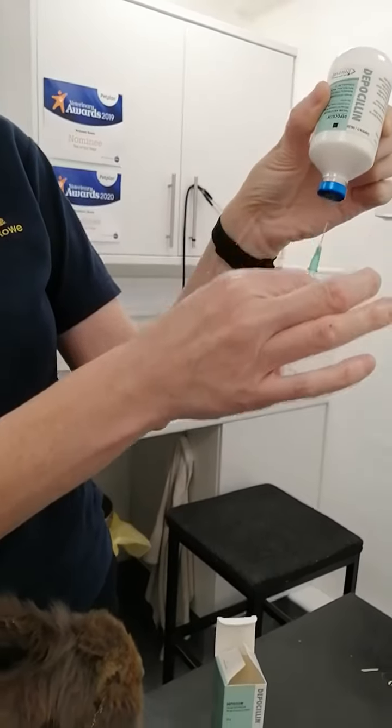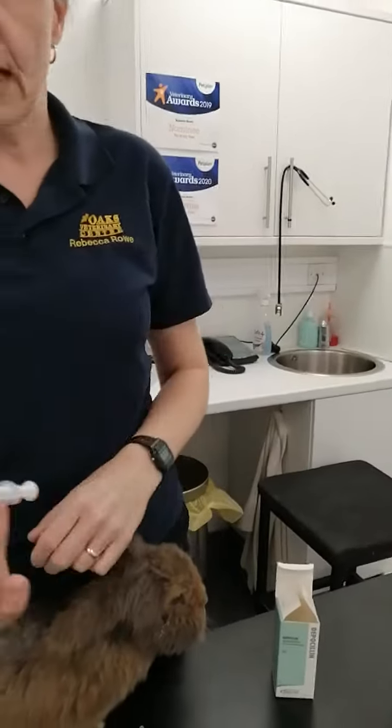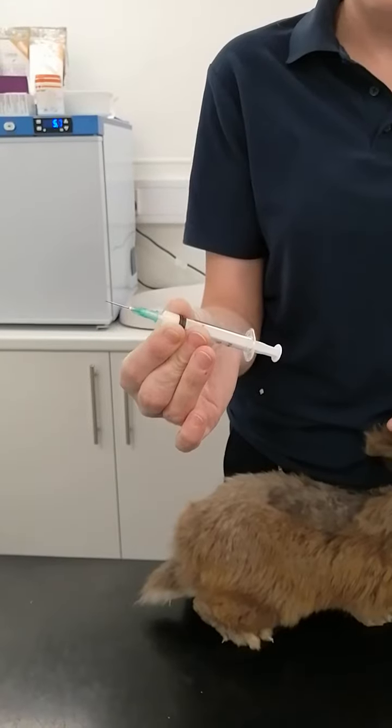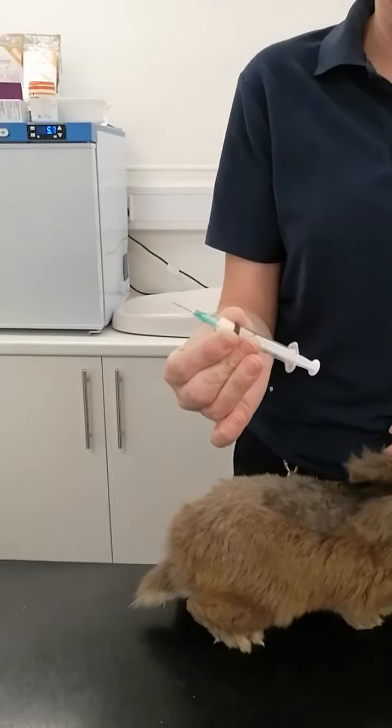Then you remove your needle — straight again — still holding it like a dart or a pencil, with your hand well away from the bottom of the plunger.